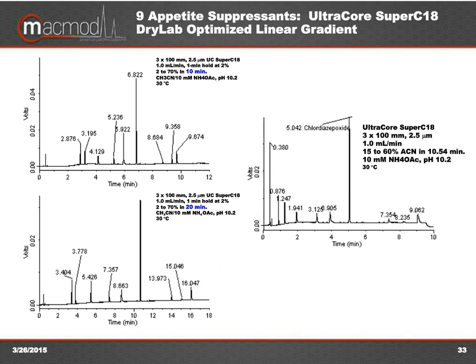So, it came out nice for that. It wasn't as complex a sample as what she had, but it was a way of coming up with a separation like that, and also showing how you can scale up. Again, the linear velocity for the left-hand chromatograms is not the same. Take that back. This one, we are using the 3 by 100 in both cases. You'll see in some subsequent slide that worked from the 2.1 by 50 to the 3 by 100.